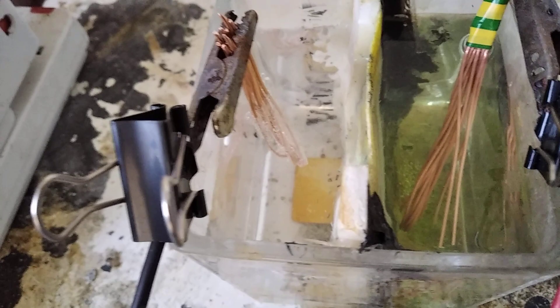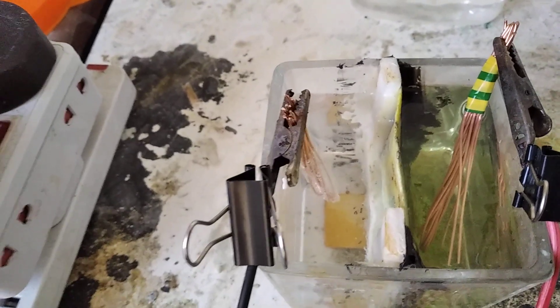There is some bubbling — but hopefully that should not really be an issue when I continue to run this cell.